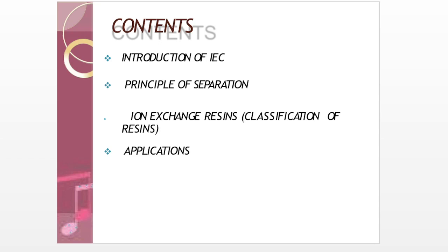Hello everyone. In this video, we will discuss ion exchange chromatography in detail. Here are the contents to be discussed in this video. First of all, we discuss the introduction of ion exchange chromatography, then the principle of ion exchange chromatography and ion exchange resins, also classification of resins, and last we discuss applications of ion exchange chromatography.